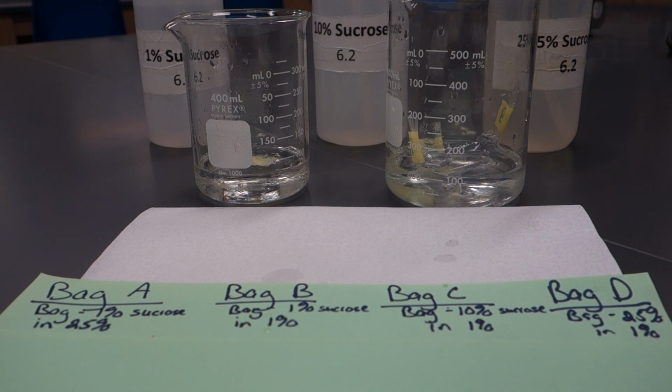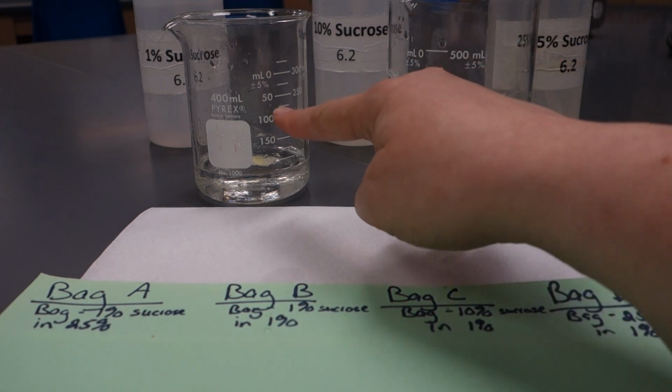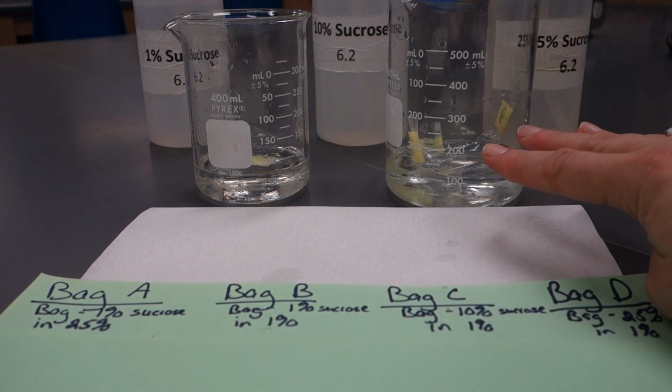So we're setting up 4 different bags with those 3 different environments. So review your information about hypertonic, hypotonic, and isotonic. So hypertonic means that there's more solute than the area we're comparing it to. Hypotonic means there's less. So when we look at these 4 bags, right, you will notice we have 2 beakers, and in those 2 beakers, there's 1 in the first and 3 in a bigger beaker.